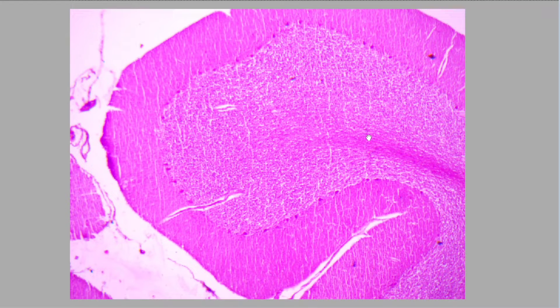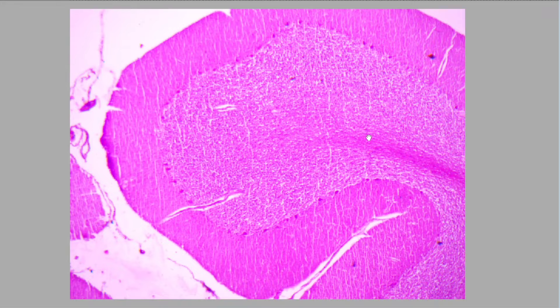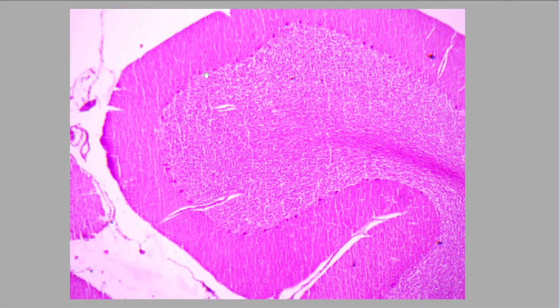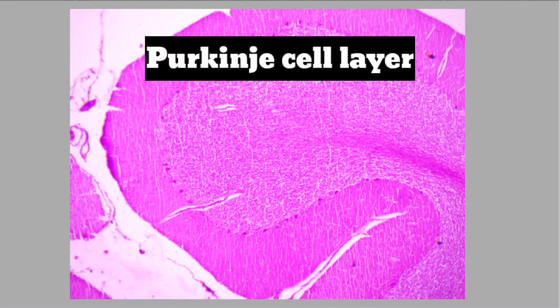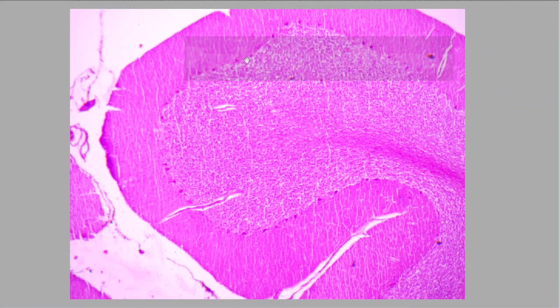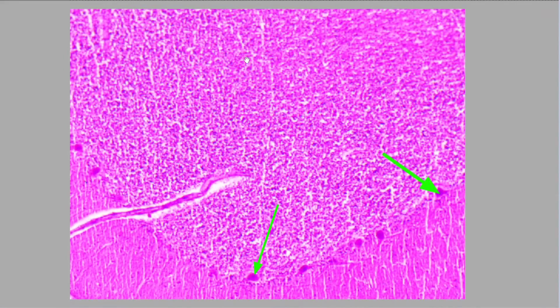The second thing to keep in mind is that whenever you are examining a cerebellum slide, you should find three layers. The most important identification point is the middle layer. This layer has multiple cells, but all these cells are arranged in a single layer — this is the Purkinje cell layer.